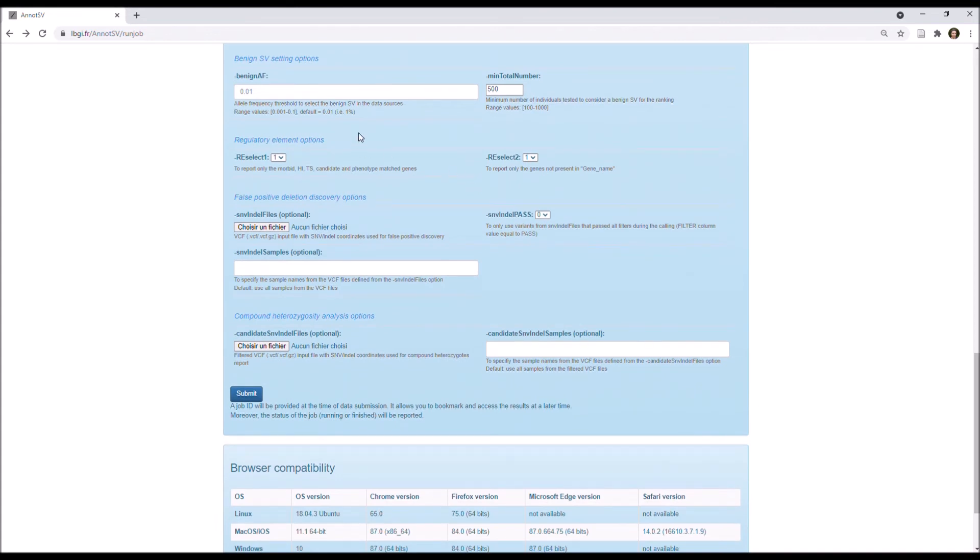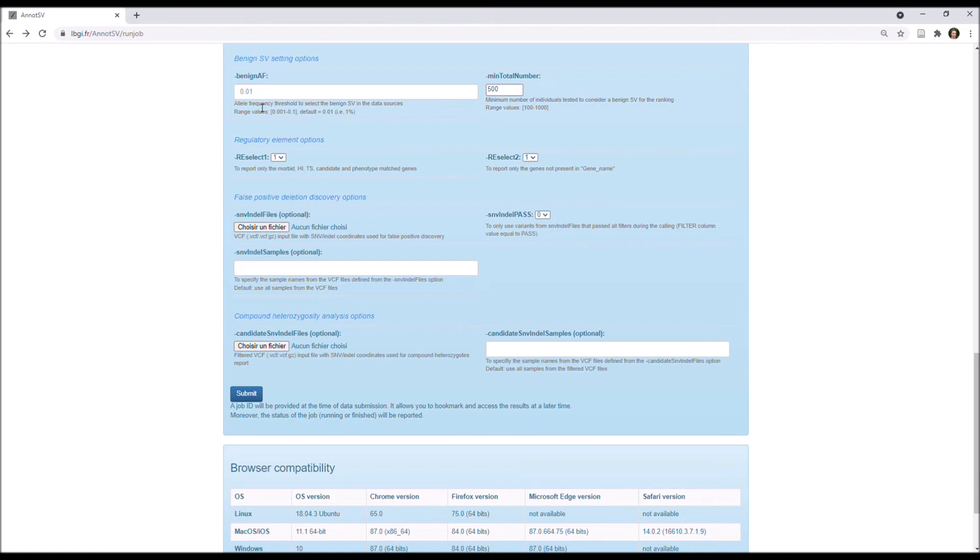Next, you have options specific to the benign SV annotations, so you can define here the allele frequency threshold that is used to consider an SV as benign in the data sources. By default, AnnotSV uses the value of 1%, what is suitable for the scenario of a rare disease, but in case of a different scenario with a relatively common disease, for example, you can set this option to 5% or something like that.